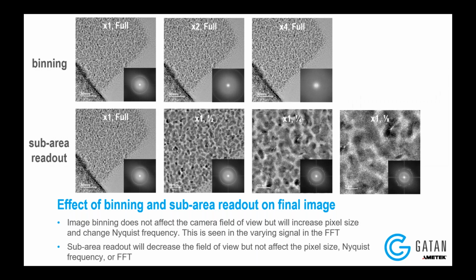And so we've given the controls to the user here to have both binning and sub-area readouts for their in-situ data set acquisitions.